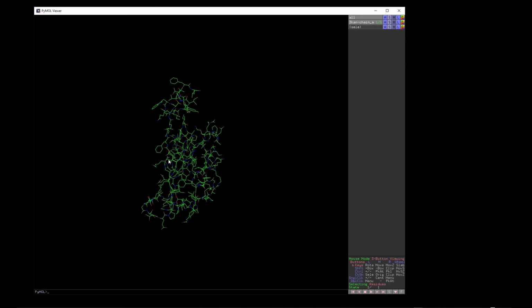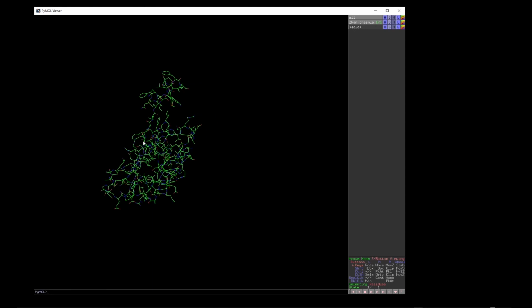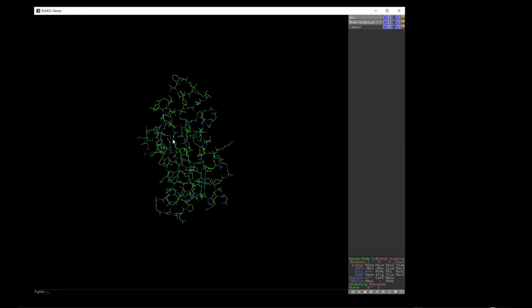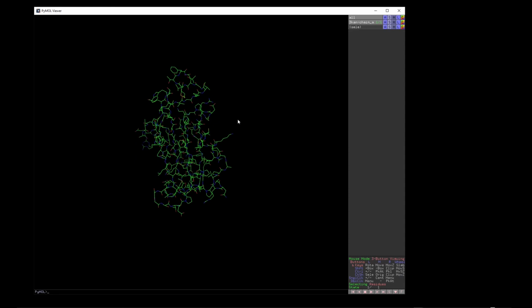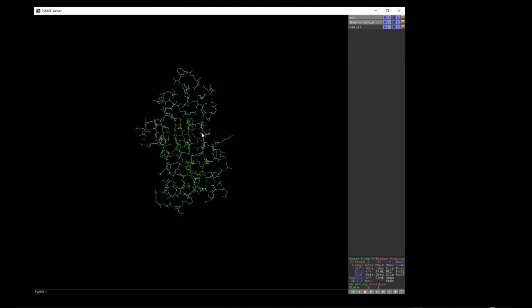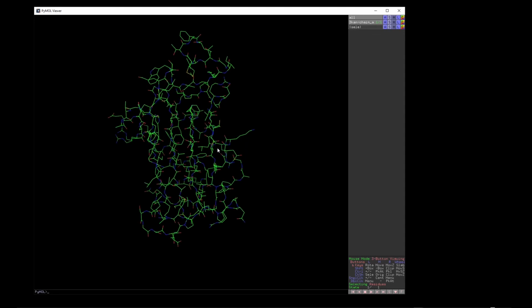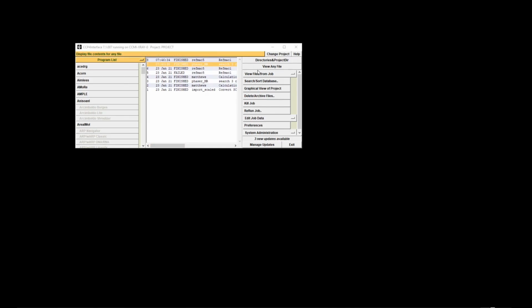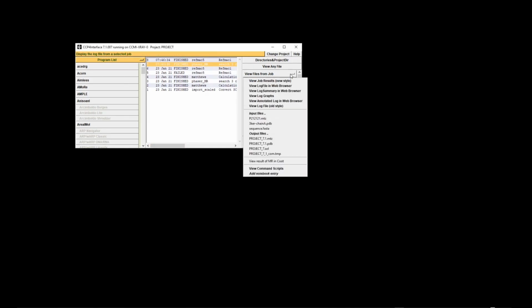And it'll do a series of rotations and translations within there until it finds a position where it can estimate what phases would be required in order for the structure factors in that MTZ, when you run the electron density calculation, to take those structure factors with the theoretical phases and come up with a structure that's approximately like this. And let's look at what the output files are.